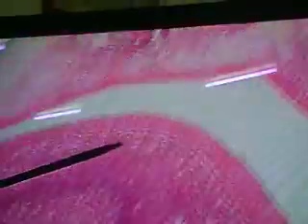Go ahead. It is said, some authors say, formed by your pharyngobasilar fascia. Alright, but that's a bit controversial. But the hemicapsule is said by some to be formed by the pharyngobasilar fascia. So there we see the stratified squamous epithelium associated with lymphoid tissue, and then glandular tissue.